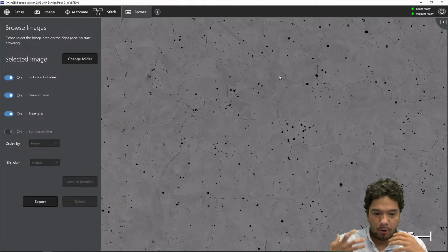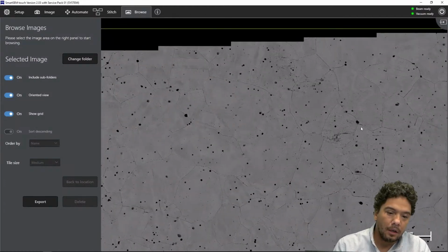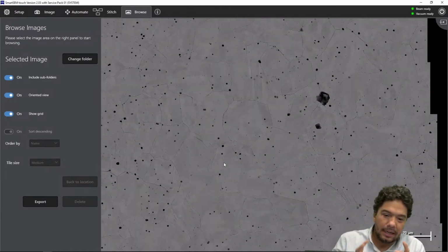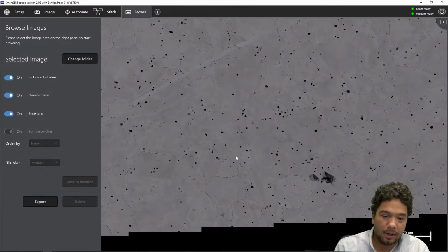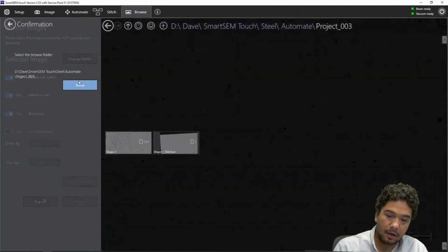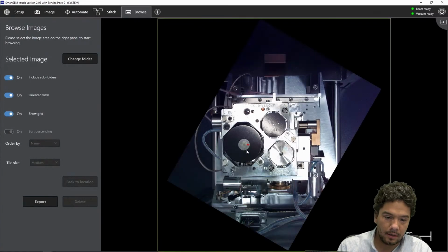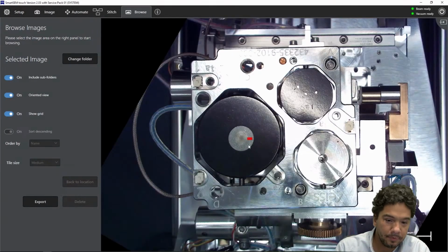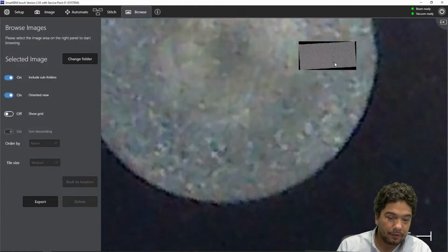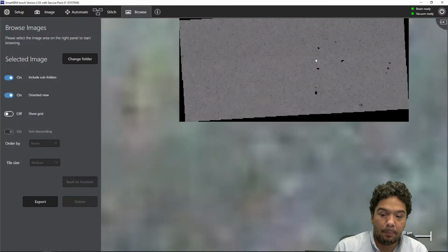Now you can navigate like using Google Earth imaging, and you can pick the area of your interest. Right now we are seeing some grain boundaries of these metals, and we can, for example, study more about these boundaries or the void that we are seeing. Finally, we can mount these tiles over the navigation image, and we can see where this information came from our sample.